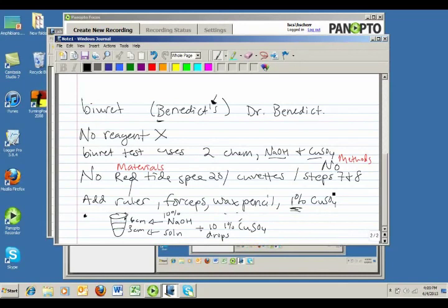And then forceps are going to be used for the Sudan-3 test, which has a piece of paper that you're going to spot and let dry liquid on. So different substances in each of these little spots. You dry the liquid, then you spot it again to concentrate it. So it's on this filter paper. The filter paper goes in a dish. So that's your dish. The filter paper will go in the bottom of the dish.